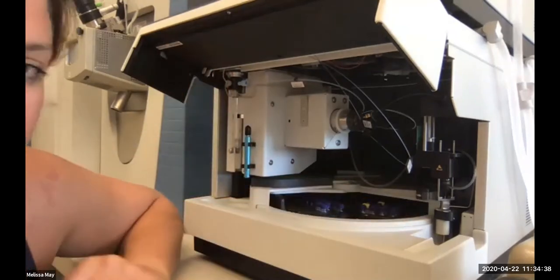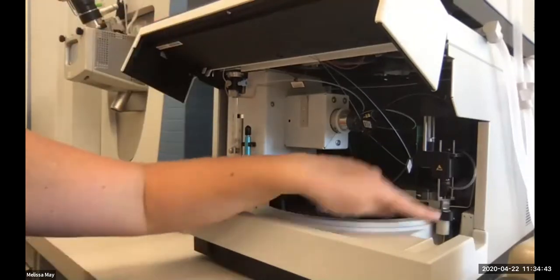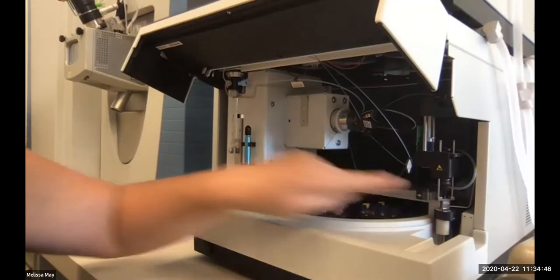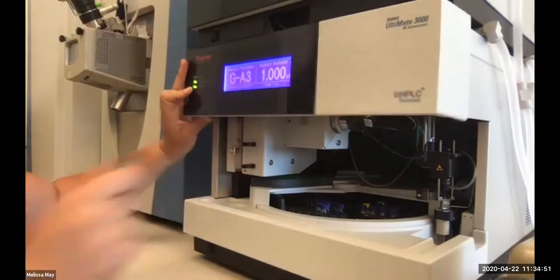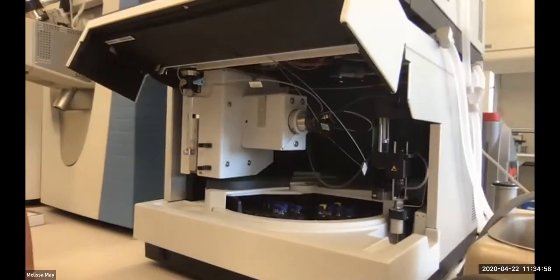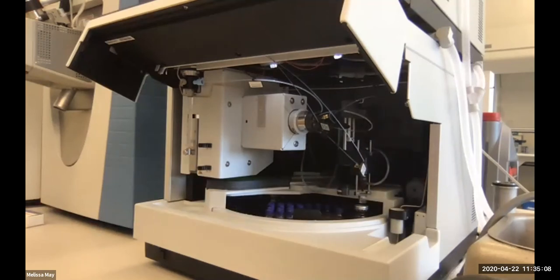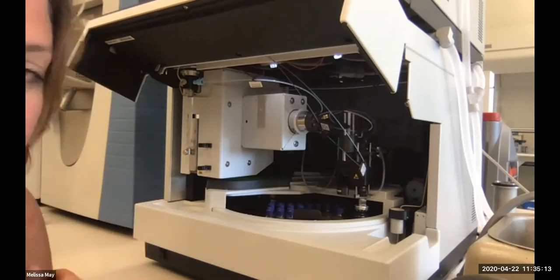There are two different positions that this can be in. This is the load position. And this is like a little waste receptacle. And so let's see if we can change it to inject. Now that's just changing the valves. Well, let's try it this way. Okay, so you can see that I just changed the position. So this is going into my loading buffer.